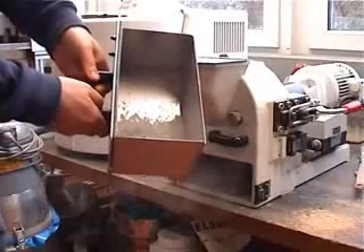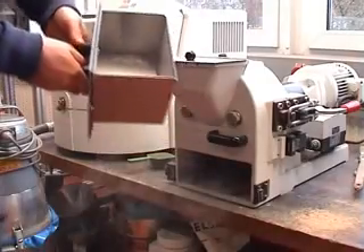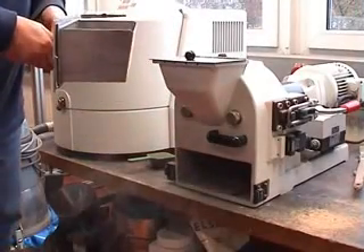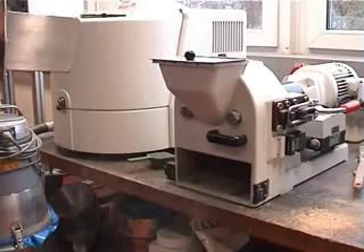If you want to grind it finer, then you just set the gap smaller. The closest gap you can set with this mill is approximately 100 micrometers.